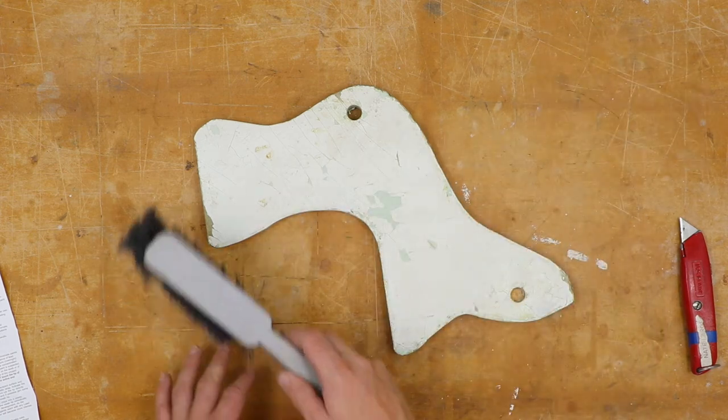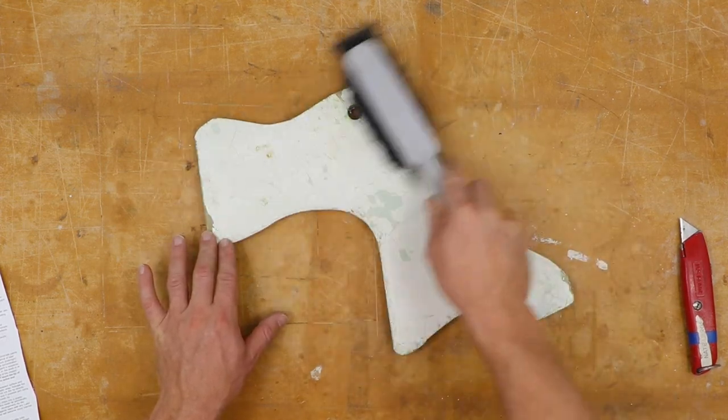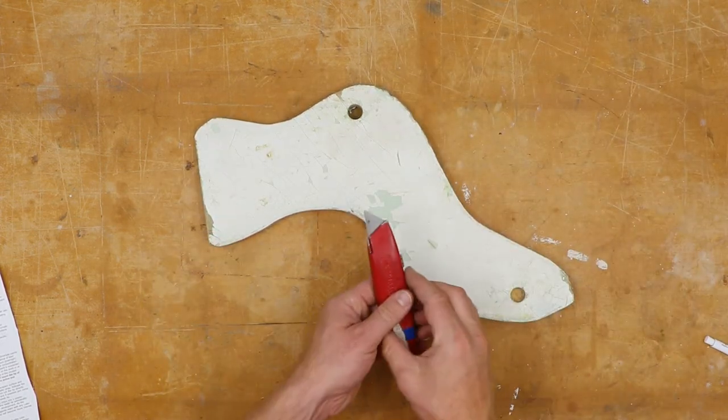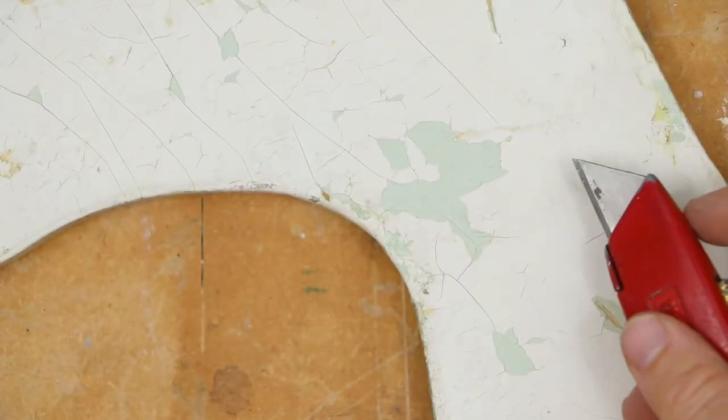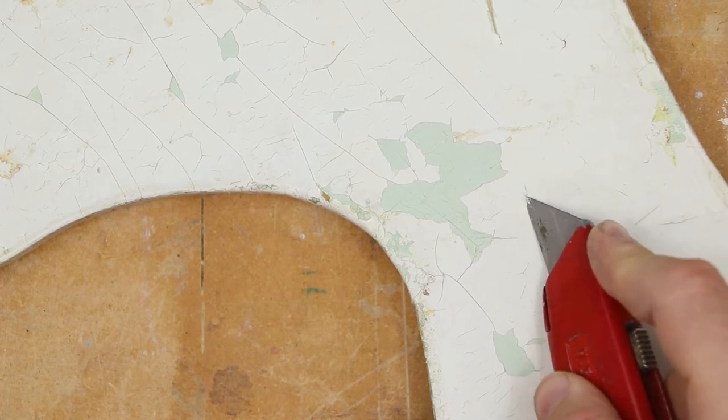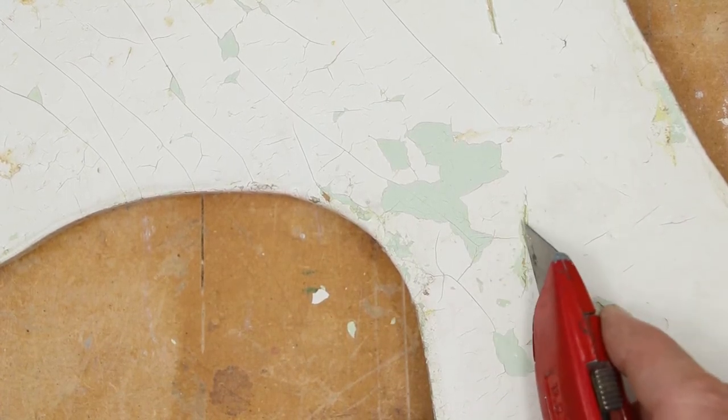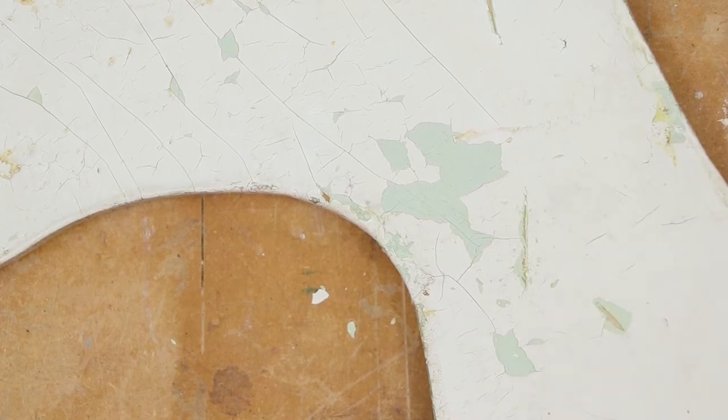So the first thing I need to do is take any dust that's settled on it and knock it off. Next, I need to take my razor blade and cut a V-shaped groove through all the layers of paint to expose all the different layers. So I can see the bare wood down there.